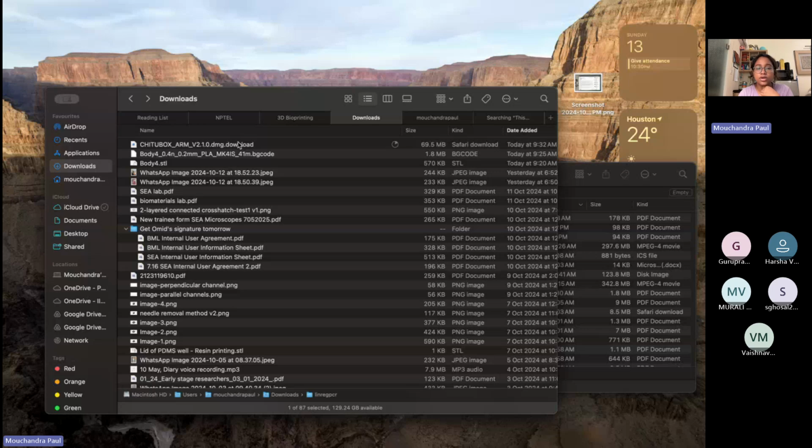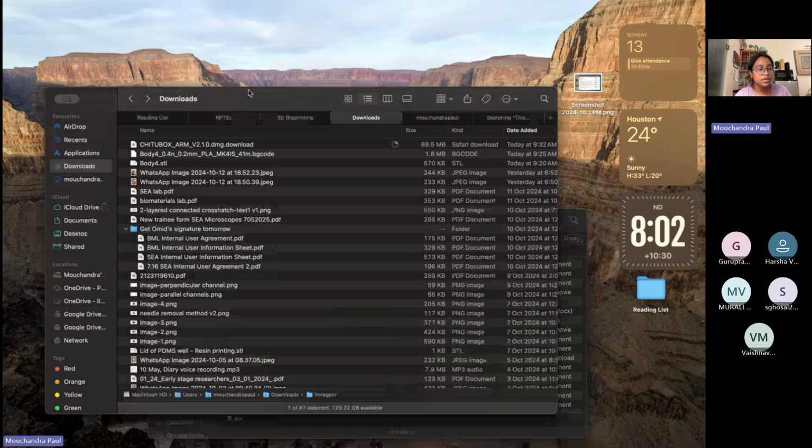All right. So I have done it here in the US, and the 3D printing world has much more convenience for new users. The software is readily available. The only thing that one needs to learn is CAD modeling first, right? So that person can actually go ahead with the 3D printing. So you have mastered the CAD modeling, all right?